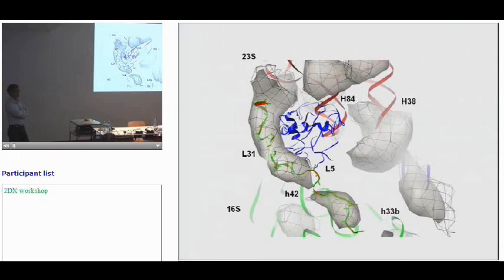I'm not quite sure, but I suppose it has to do with the observations and the lattice line fitting. So the deviations of the experimental measurements from the fitted lattice line.